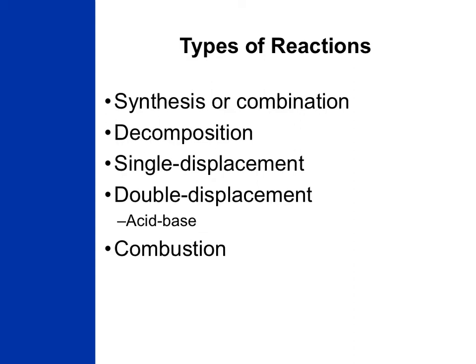When we study chemical reactions, chemists, at the most simplest level, classify reactions into 5 types: combination, decomposition, single displacement, double replacement, and combustion. We've already seen a couple of these types in action when we performed the decomposition of limestone experiment and synthesized aspirin. In this lab, we're going to explore some of the driving forces behind chemical reactions, particularly the double displacement reactions, and one of the ways that we know that a chemical reaction is occurring.